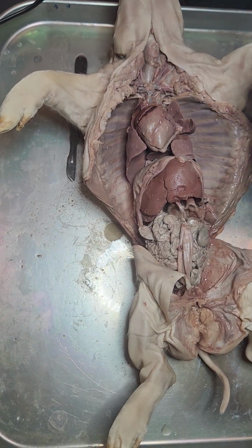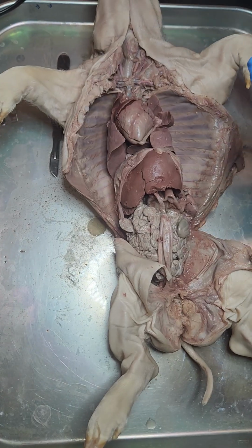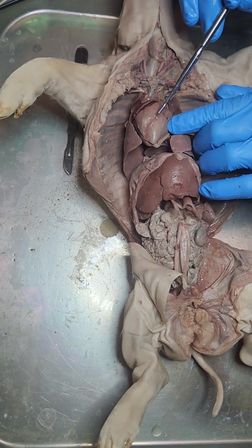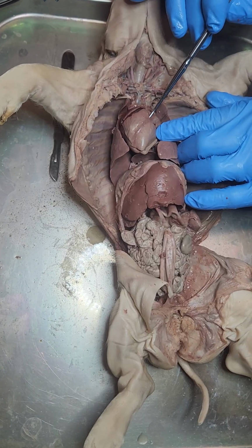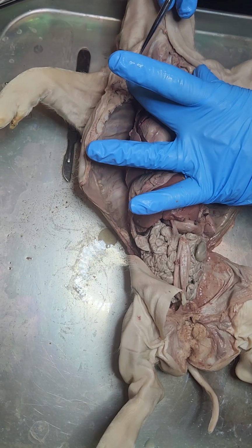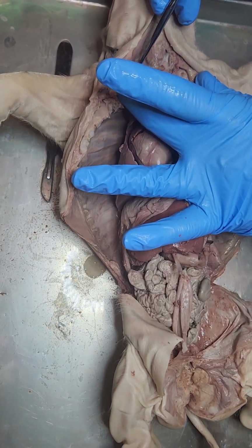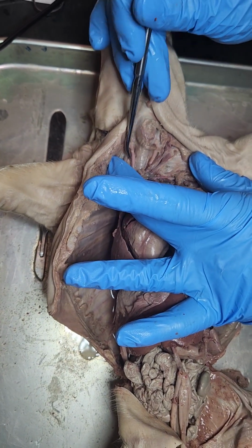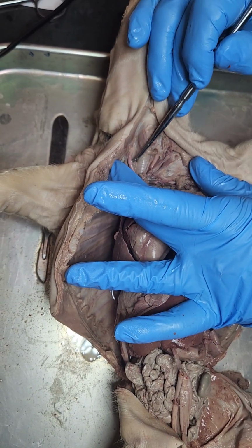Carotid artery. Now, it's spelled carotid, but we say carotid, it's in the neck. It's easily confused with coronary. Think massive coronary event. That's the way you can remember that. Carotid artery is right next to, we say proximal to, the trachea right here. So that's a carotid artery right there, that one right there.